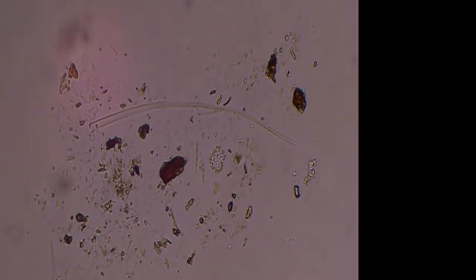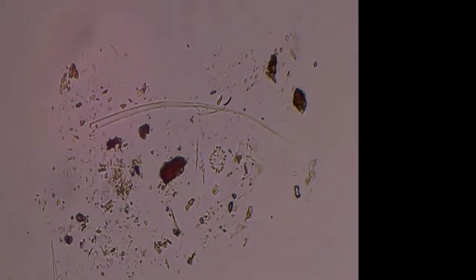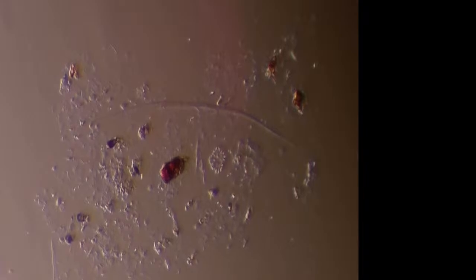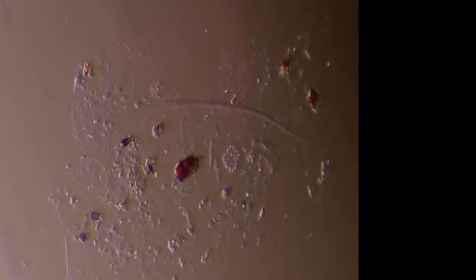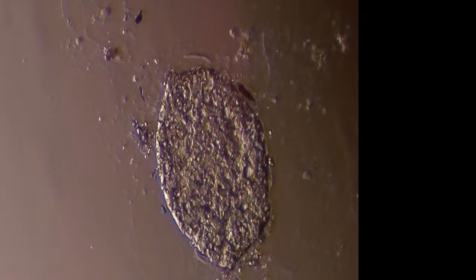Focus it a little bit better and fix the color, make it a little more natural looking. Scope view, the kind of reddish color. Back to this mode. There's a nice red color there. Yeah, so something definitely fell apart here. So a little debris field with some stuff still intact, like this section right here. There's death all over this slide.